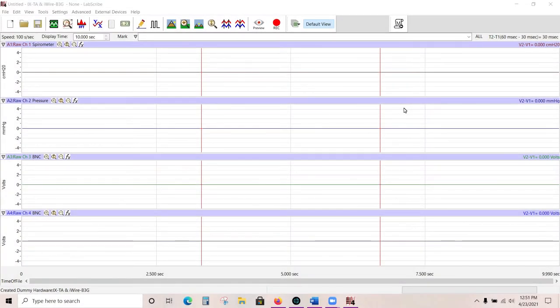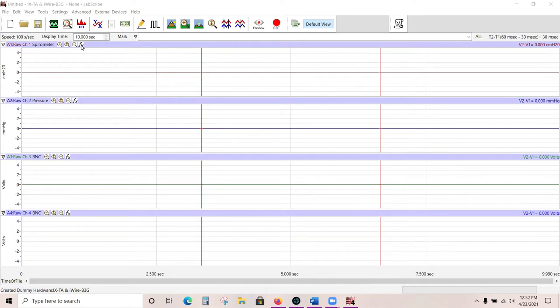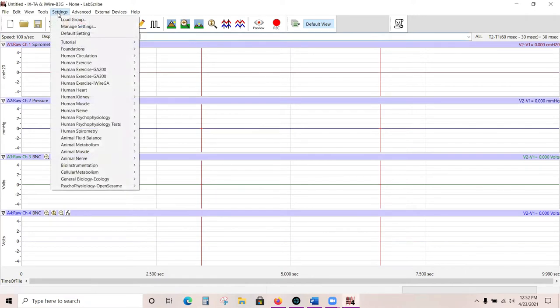This is a training for learning how to use LabScribe. LabScribe is the software you will be using to run your iWorks systems. It can be downloaded from our website at www.iWorks.com. When you first open LabScribe, this is the screen that you will see. It will show some graphs and they will all say raw channel. This is not currently set up to record any data from a lab, so the first thing you need to do is go into Settings and choose a lab.